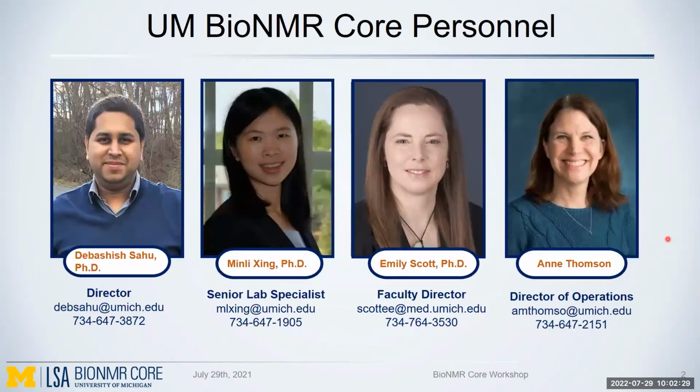And first, I want to introduce the biomolecular NMR staff to you. Deb is the director of our biomolecular NMR lab. He's mainly responsible for the 600 and 800 NMR instruments that are located in the chemistry building, and those instruments are used for protein NMR experiments. And I mainly work in the Mary Sue Coleman Hall, and I'm responsible for the 400 and 600 megahertz NMR that are used for small molecule NMR experiments.